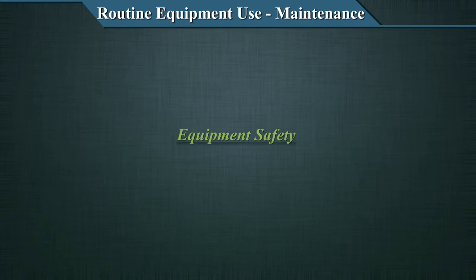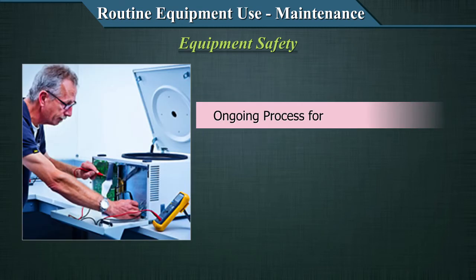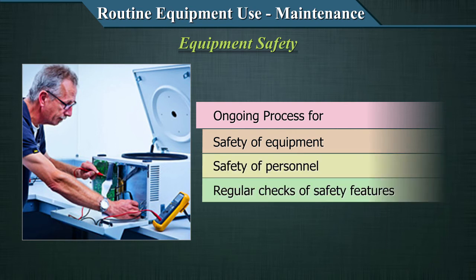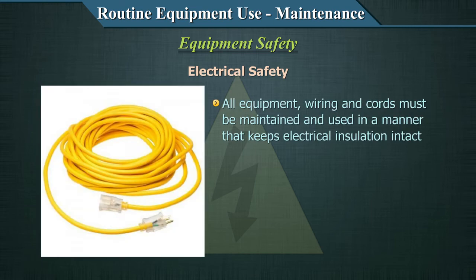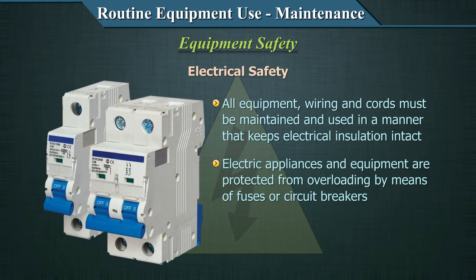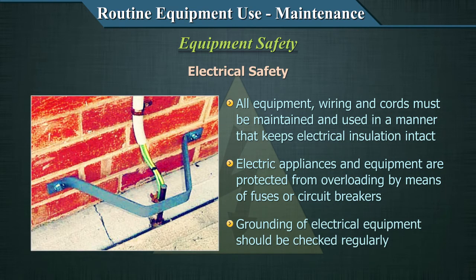After MQ, we come to another vital concept: equipment safety. This is an ongoing process to ensure the safety of both equipment and personnel, with all electrical and mechanical safety features regularly checked and maintained. For electrical safety, all equipment wiring and cords must be maintained with electrical insulation intact. Electrical appliances and equipment should be protected from overloading by fuses or circuit breakers. Grounding of electrical equipment should be checked regularly, as it protects equipment operators — if there is a fault, electricity flows into the ground rather than to the worker.